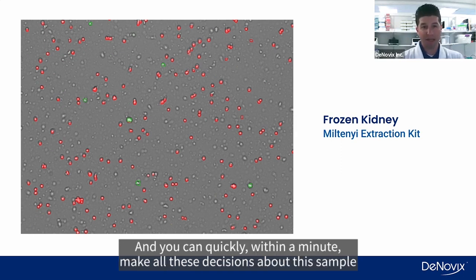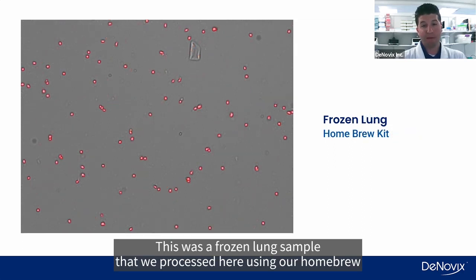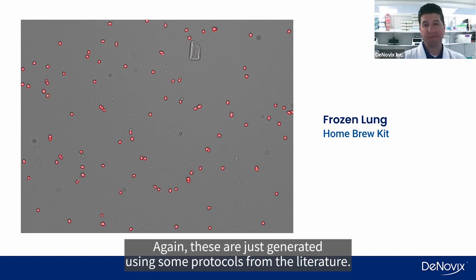And you can quickly, within a minute, make all these decisions about this sample and move on to your downstream application. This was a frozen lung sample that we processed here using our homebrew buffers, similar to the buffers I used for today's extraction. Again, these were just generated using some protocols from the literature.